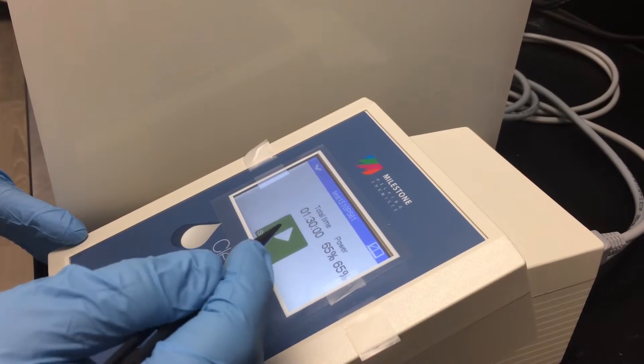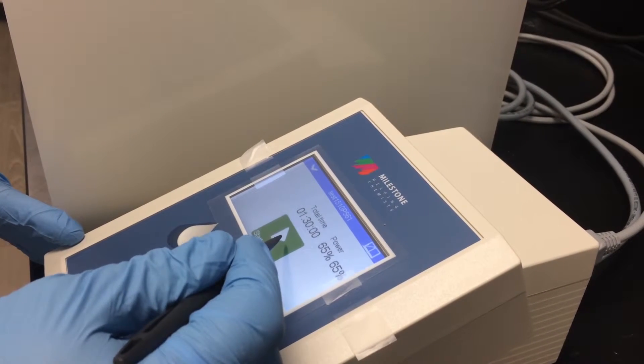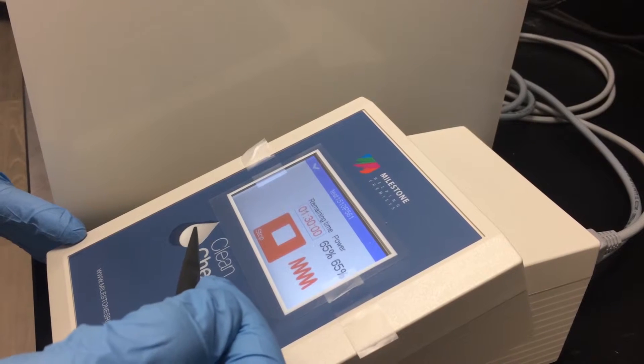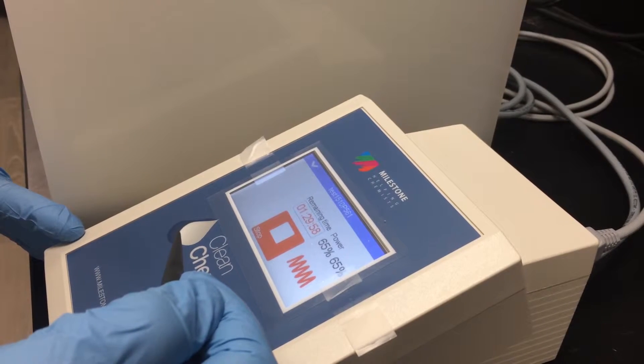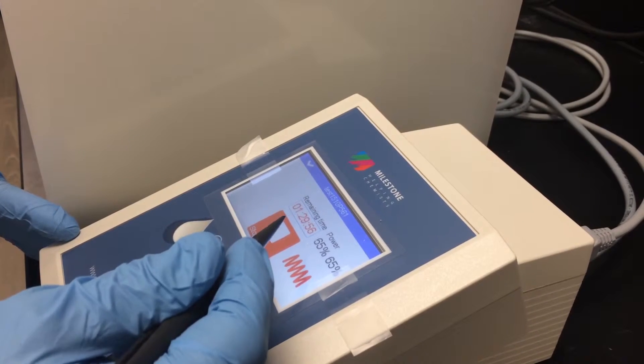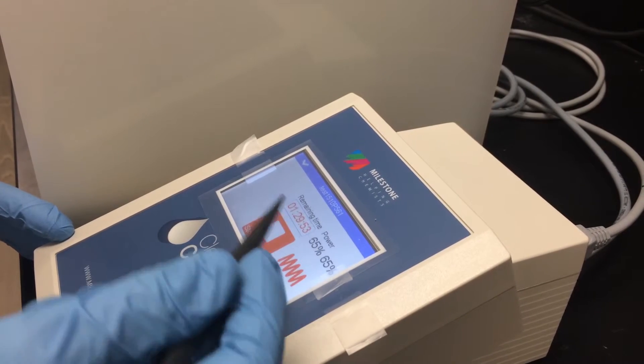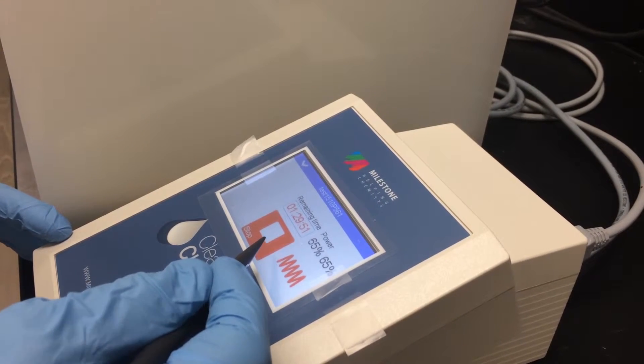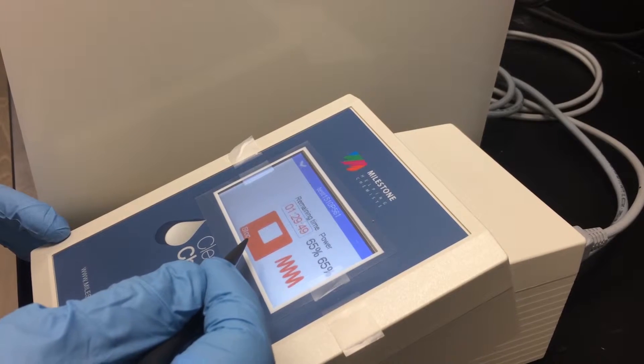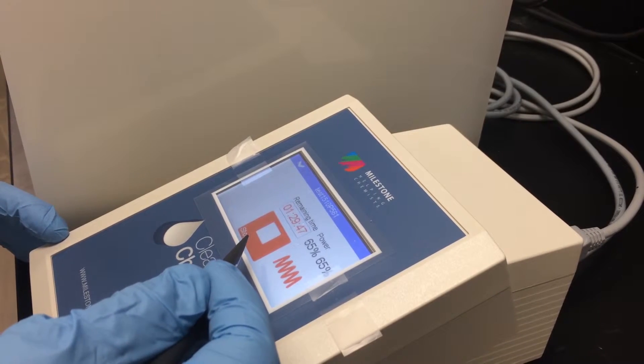Once finished we'll hit the back arrow and we hit start to begin the distillation program. The terminal will let you know how much time is left in the cycle and you have the ability to stop the program if at any time there becomes a need to immediately stop the distillation.